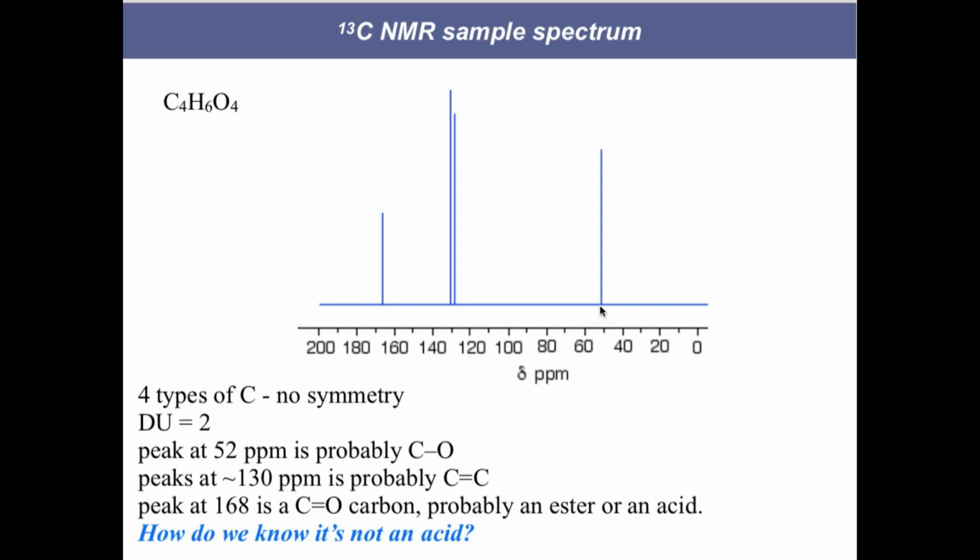We've got a peak just above 50. This is actually at 52. That means that we are in carbon-oxygen single bond territory.